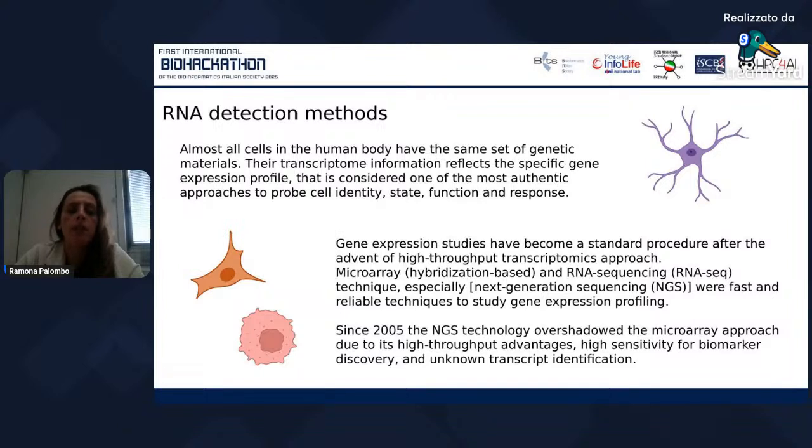For this reason, gene expression studies have become a standard procedure after the advent of high-throughput transcriptomics approaches.